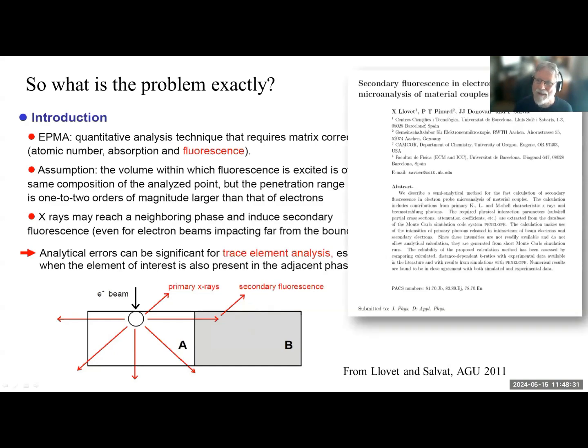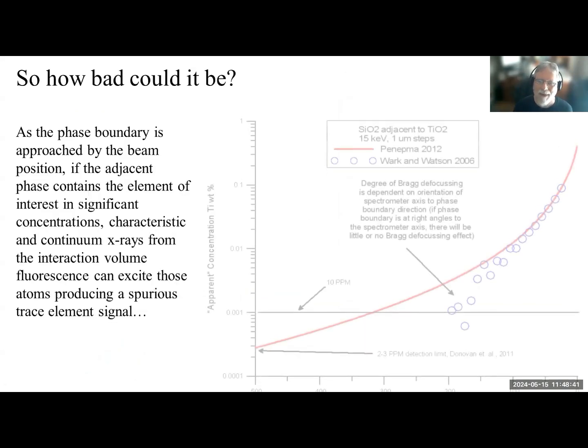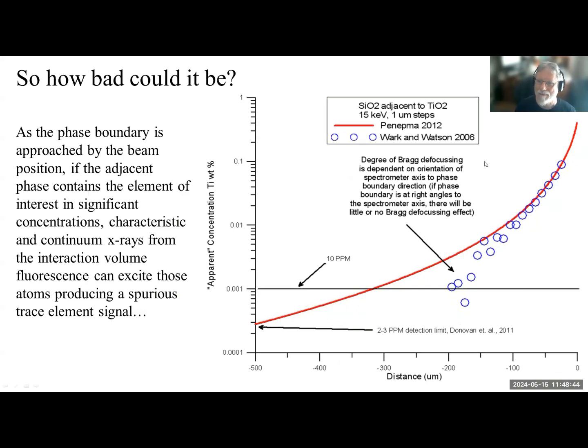This was published a few years ago, and I highly recommend reading it. We've got some great examples in here. And there's also the paper by Borisova et al. So how bad exactly could this be? Well, here's an example that Wark and Watson did.